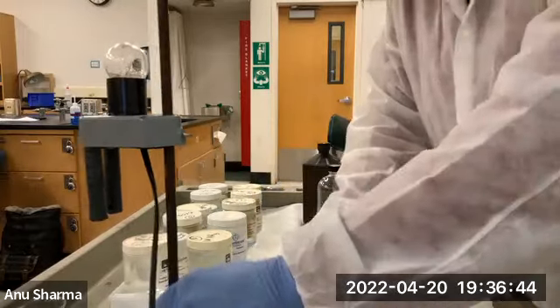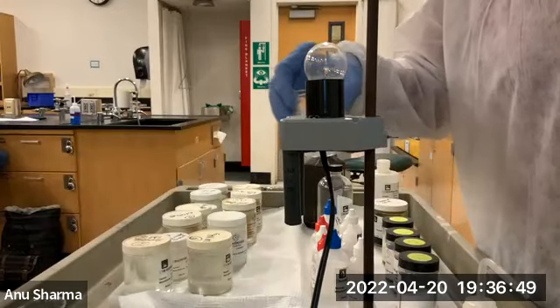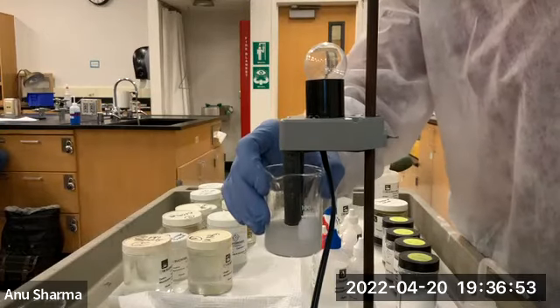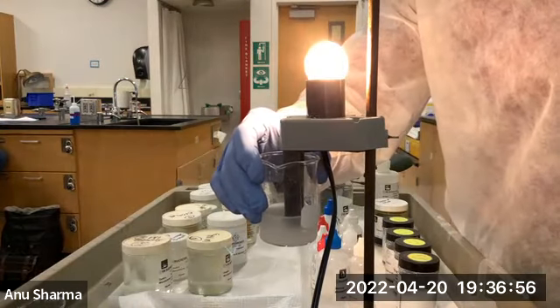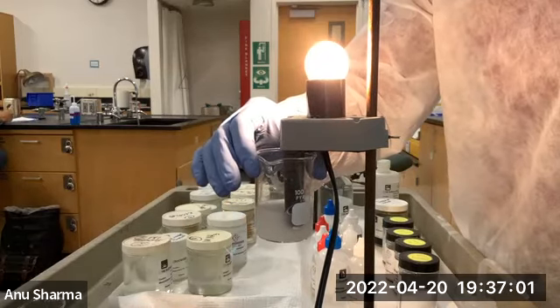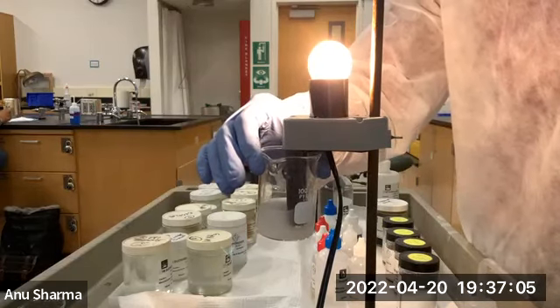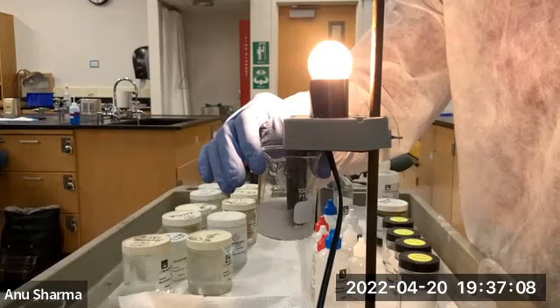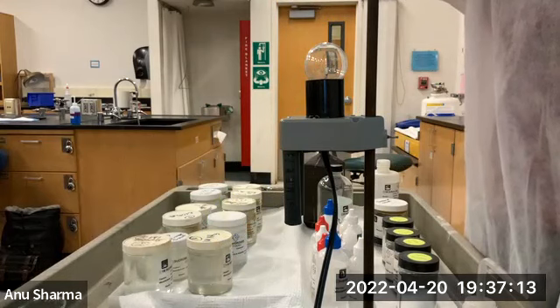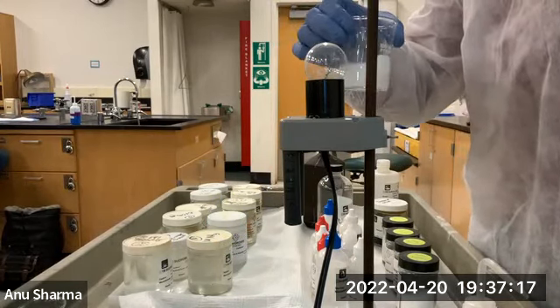Barium hydroxide and sulfuric acid, when they mix, you see the turbidity. In this reaction, we should have used the exact amount of H2SO4 that was needed, because there's still some residual sulfuric acid and some residual barium hydroxide. However, the reaction has started and eventually you will see more and more barium sulfate forming.